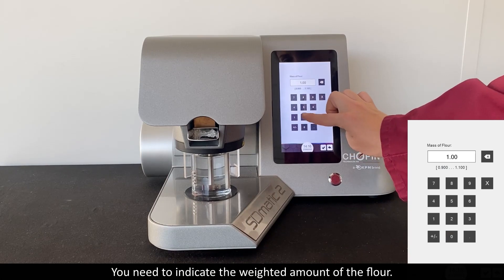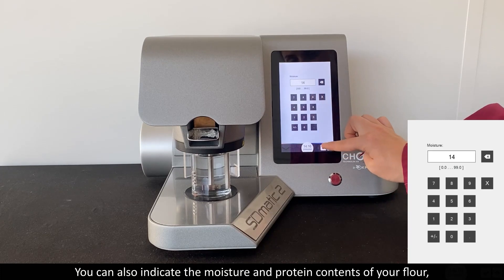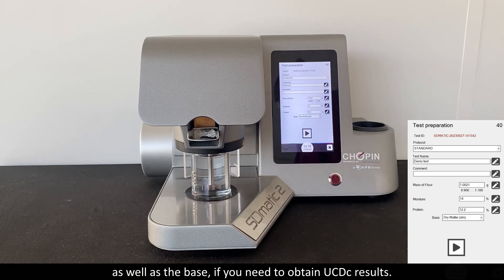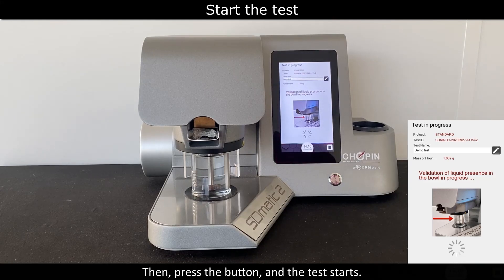You need to indicate the weighed amount of flour. You can also indicate the moisture and protein contents of your flour, as well as the base if you need to obtain UCDc results. Then press the button and the test starts.